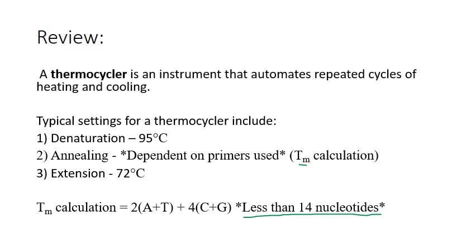And that video is located on the same sheet here, and you can get on there and watch those steps over and over again, or watch this one over and over again, whichever you want. The other one's probably faster, but watch those steps. Make sure you know what you're going to be doing at each step. That's always important whenever you are doing a lab. So make sure you're consistent with that.